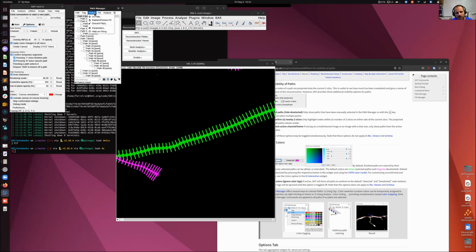But now for that location, we can obtain a cross section and try to fit a circle, because again, the assumption here is that these are tubular structures, and so in cross section they will be circular. Then we can detect the centroid of that circle, and we can do two things. We can snap the centroid of our curvature to the center of that circle, and we can estimate the diameter of that circle.